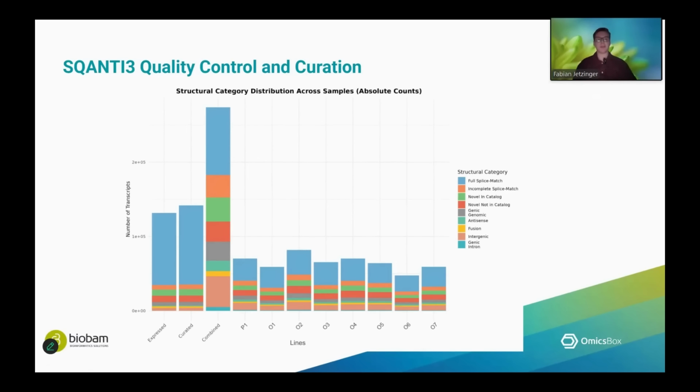Neither are we guaranteeing that all of the things we filtered out are non-genuine, but at least it has applied our rules, which we could also, of course, go back and further adjust. It has applied our rules, and it has given us a lot more confidence in the transcriptome that we have curated, in order to have a bit more trust in our results in any downstream analysis going forward.